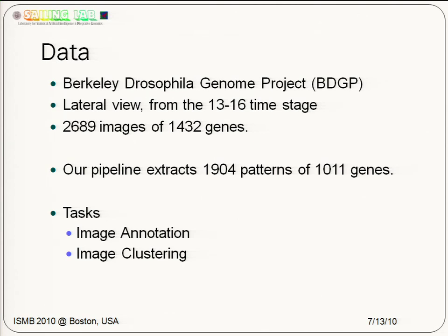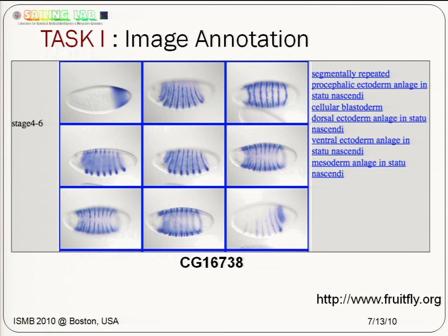Imaging. You have a bunch of images created, and with labeling where was the gene labeled as expressed, ectoderm and so on.